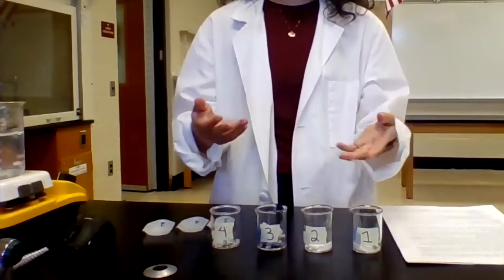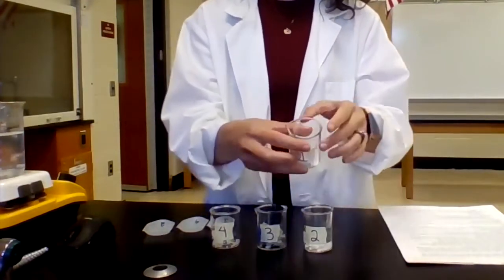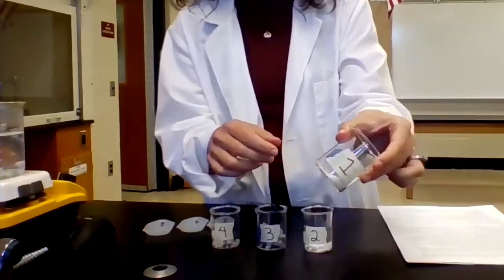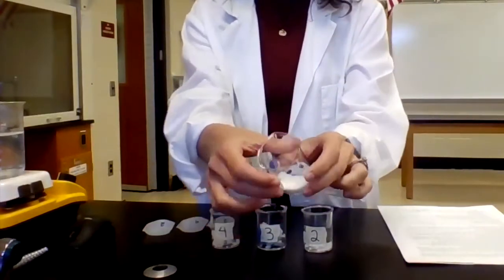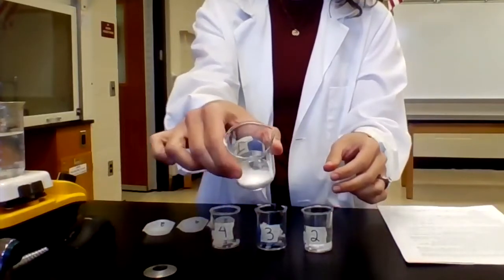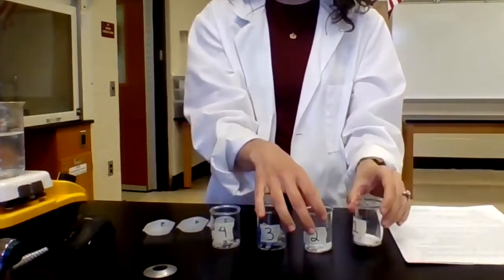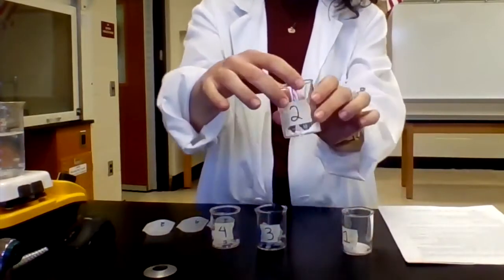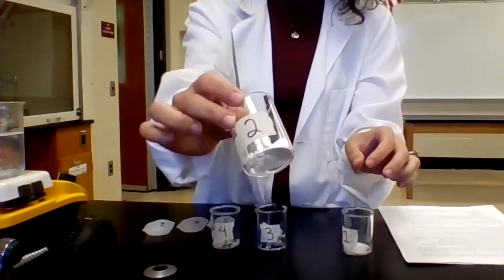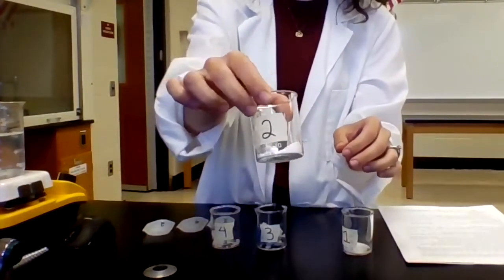The first thing that you want to do is take note of the appearance. We can see that with solid 1, it is granular. It's not a powder. It's definitely a little more crystal-like, but obviously it is white. There's no color to it. For solid number 2, though, this actually is a bit more powder-like. It doesn't look crystalline.